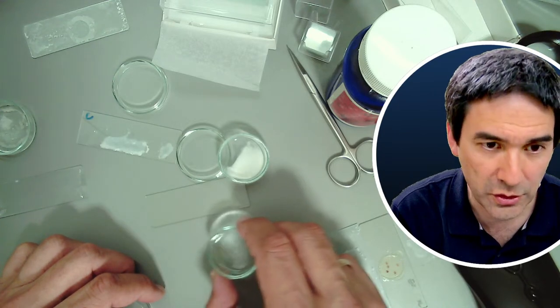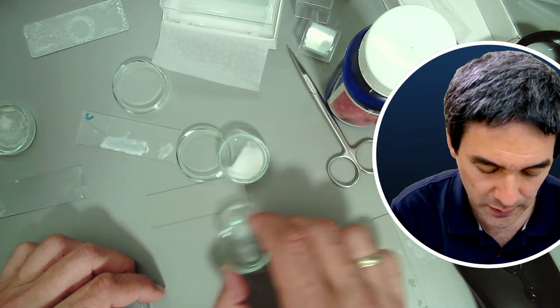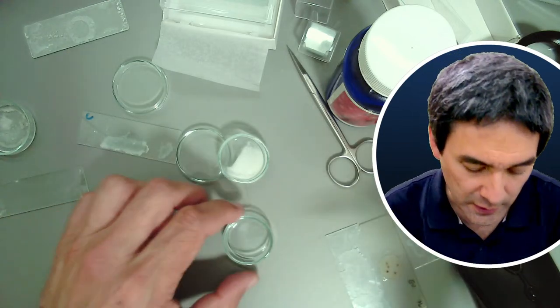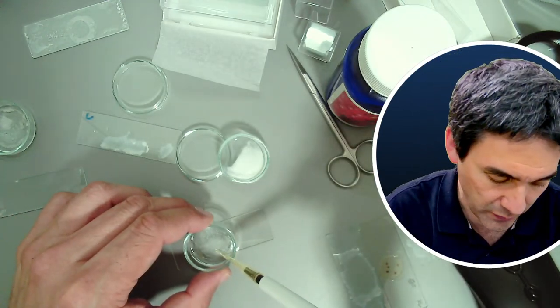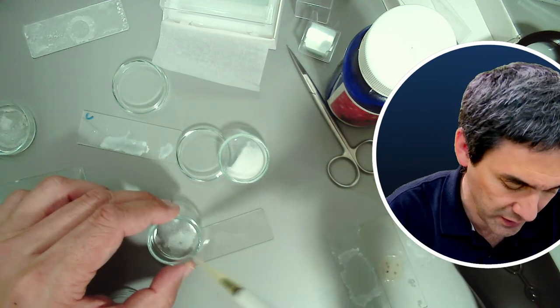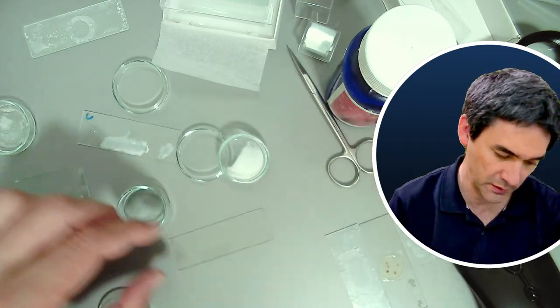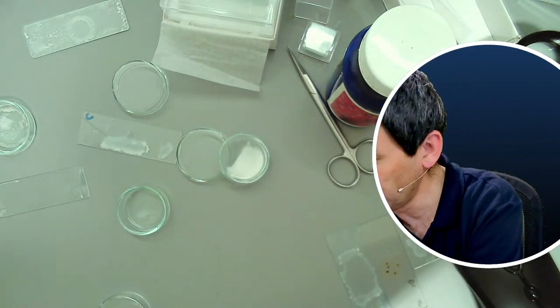It's slowly starting to dissolve. And let's try the same thing. I don't mind if I also get some of the non-dissolved crystals. That's fine, because they might look nice as well. And let's quickly put it again under the microscope here.